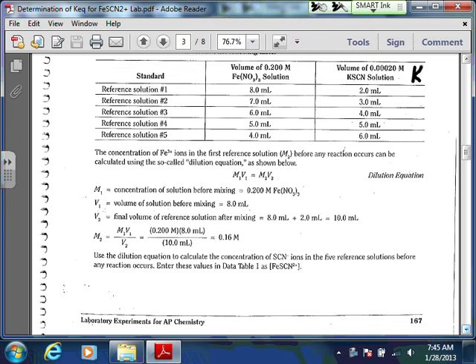As soon as you put that into, this is an ionic compound, so as soon as you put that into a solution, it's actually going to split apart into K plus and SCN minus, and the concentration is going to be equal because this is a 1-to-1 ratio here in this formula. So if we have 0.00020 molar KSCN, then we also have 0.00020 molar SCN minus. Okay, so we know our initial concentration of the SCN minus, but what they're saying here is we're adding that to the Fe(NO3)3 solution. So we're starting out with a 2 milliliter solution. We're going to end up with a 10.0 milliliter solution.